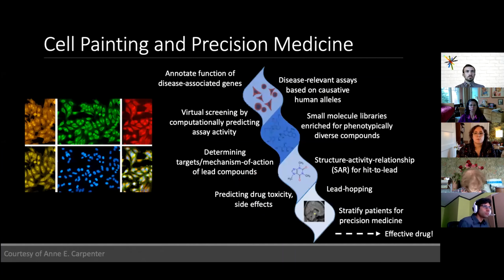And so this has really incredible potential to be used not only as a research tool, but as a discovery tool for therapeutics. And towards this, the Broad Institute has recently established a new initiative called JUMP-CP, for Joint Undertaking in Morphological Profiling with Cell Painting. It works based on this technique, and they have partners in industry as well as in nonprofits with the goal of generating a large cell imaging data set to enable discovery of drug pathways for precision medicine.